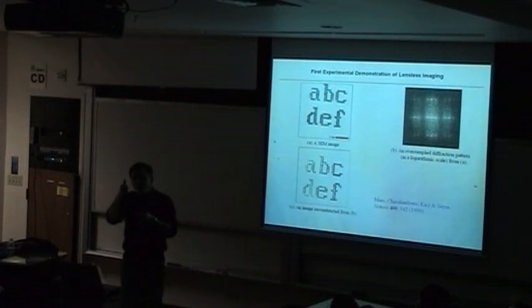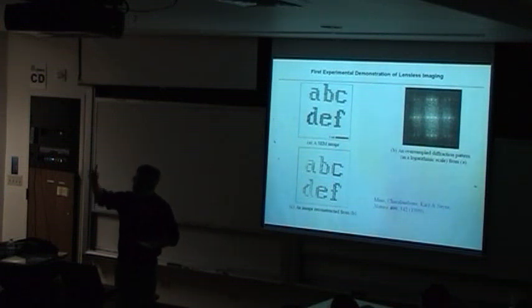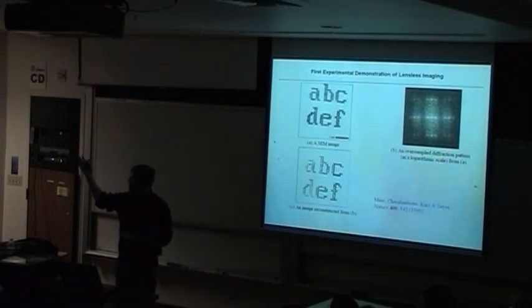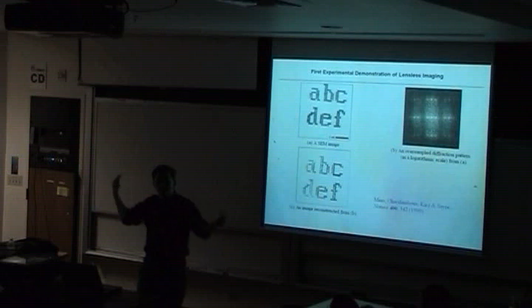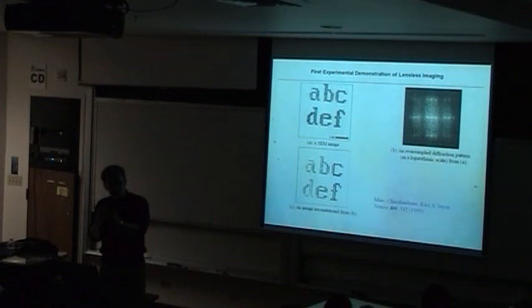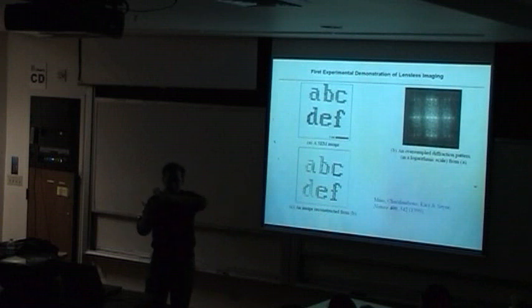Now, there's one very beautiful method to overcome it, which is fluorescence microscopy. Fluorescence microscopy completely removes the DC term, completely removes the ocean wave. So you can see very small ripples. Like at night you can see the stars nicely, but at daytime you cannot see them because sunlight completely dominates. That exactly corresponds to lens-based microscopy. So one way is to use different wavelengths and filter it out. This is why fluorescence becomes so powerful.